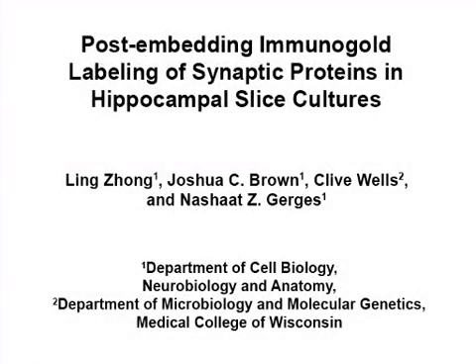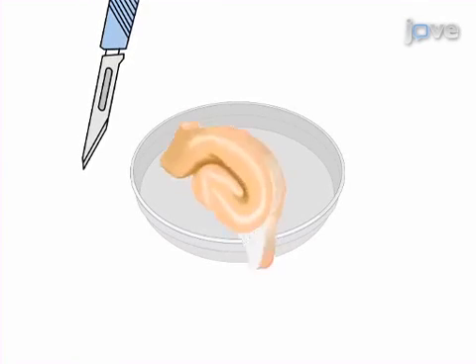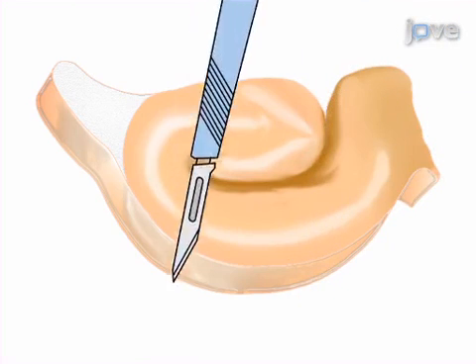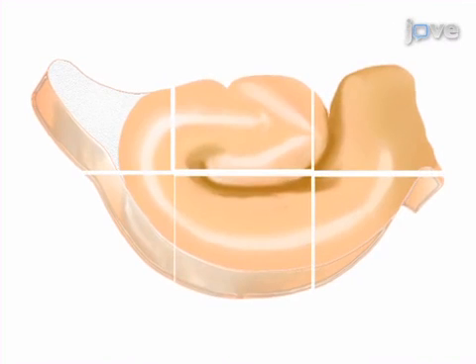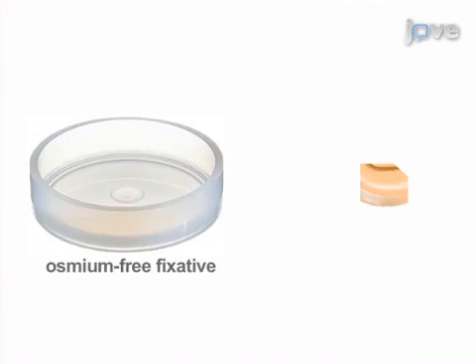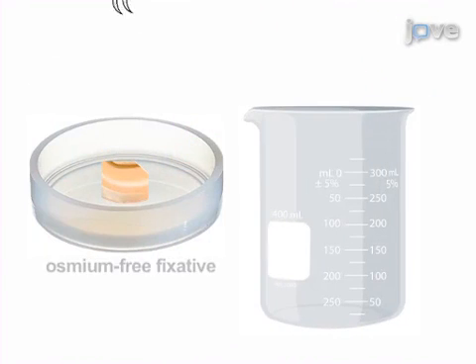The overall goal of this procedure is to perform immunogold labeling to determine the ultra-structural localization of synaptic proteins in rat hippocampal CA1 pyramidal neurons. This is accomplished by first removing the CA1 region of the organotypic slice, trimming the top corner to remember the correct orientation, and incubating it in an osmium-free fixative on ice.